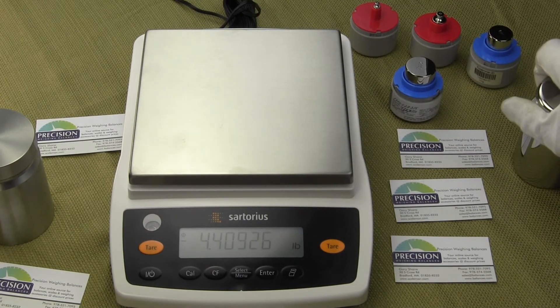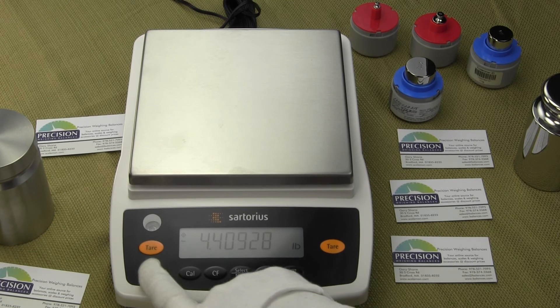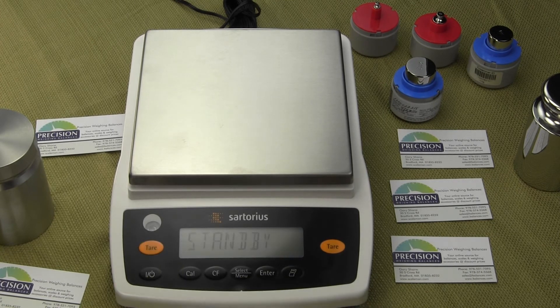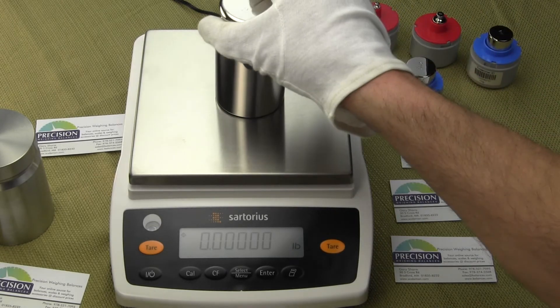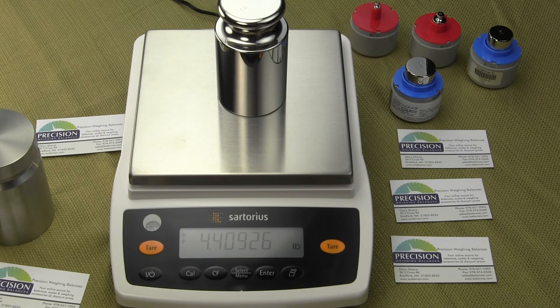I'm going to take off this two kilogram weight and shut off the balance — it goes into standby mode. Now we'll turn the balance back on. It goes through the power-up sequence, and now the unit weight is pounds. I'll put the calibration weight back on — this is a two kilogram weight, which is about 4.4 pounds — and it's reading correct.